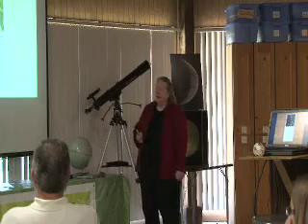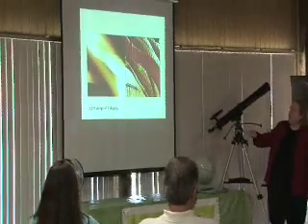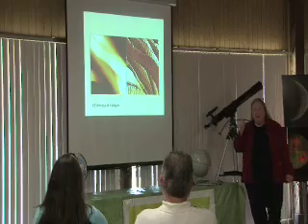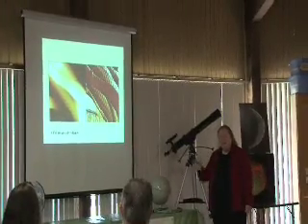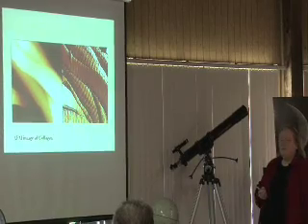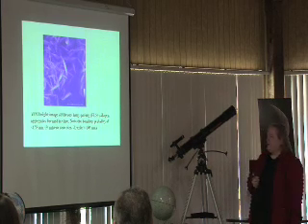These are collagen. Collagen's another important protein. And zooming in to see the sides of the collagen, you can see the ribs and the actual detailed structure, the very intimate details of what your molecules look like. And that's what AFM can do. And imagine your children and grandchildren will be seeing these in their own schools probably in the next couple of decades or so, maybe 10 years, maybe 15.